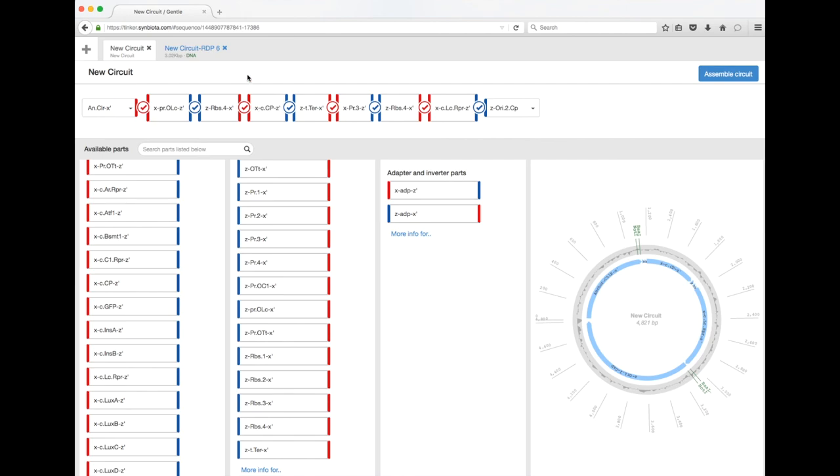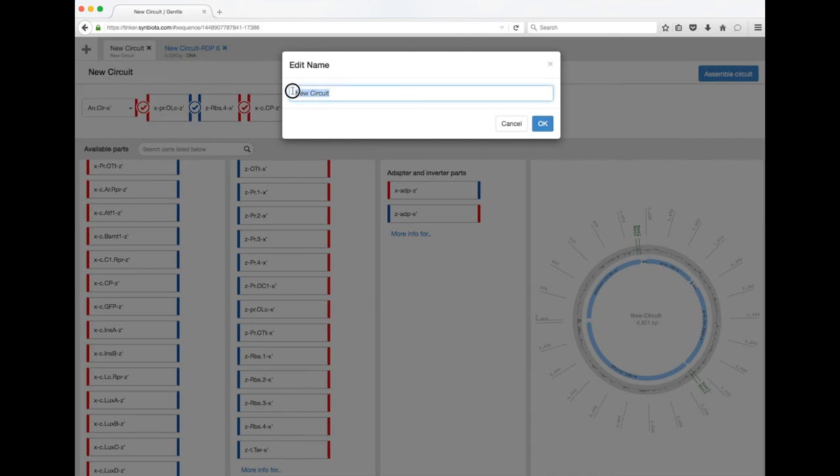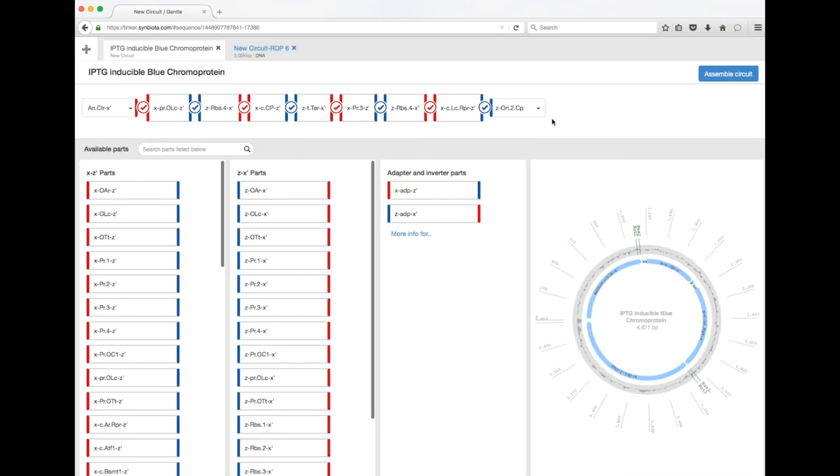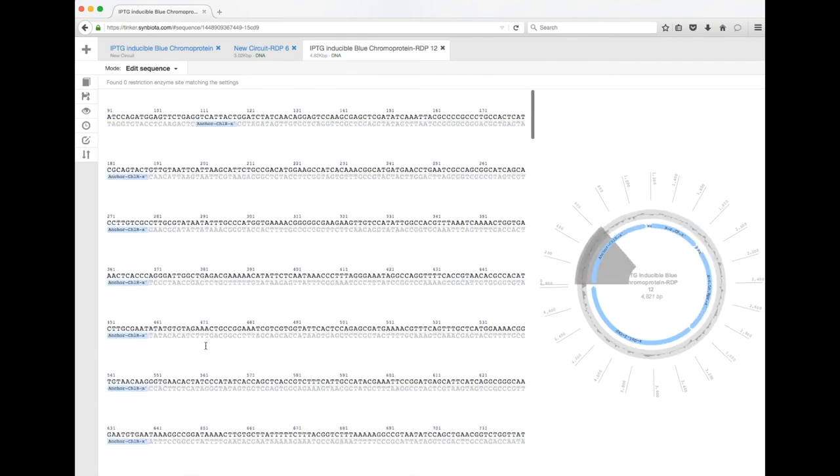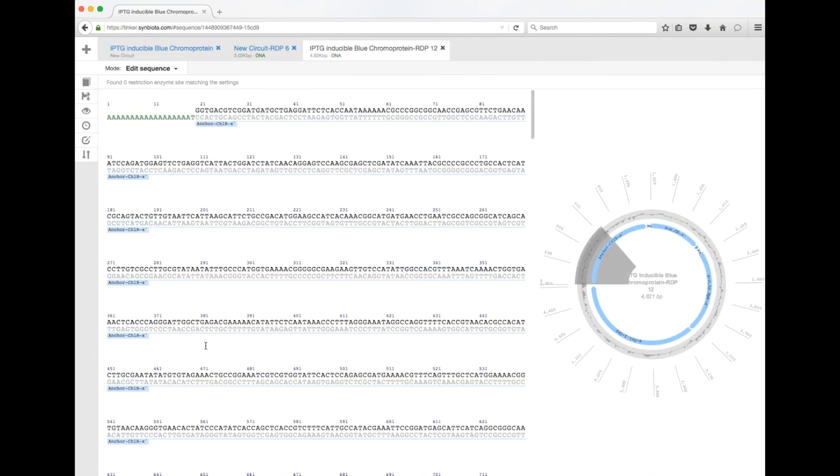So in this case we're going to call this the IPTG-inducible blue chromoprotein. Alright, enjoy!